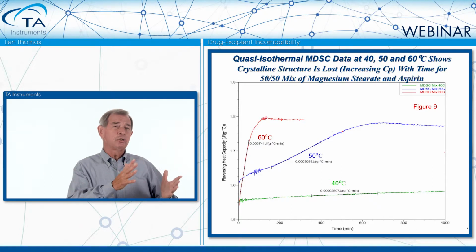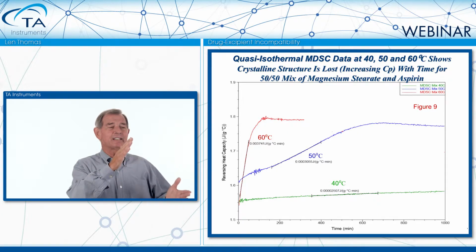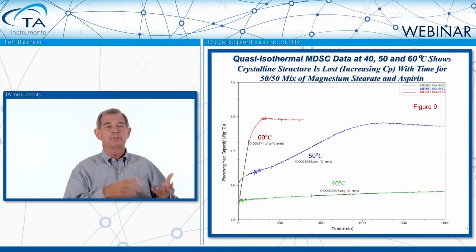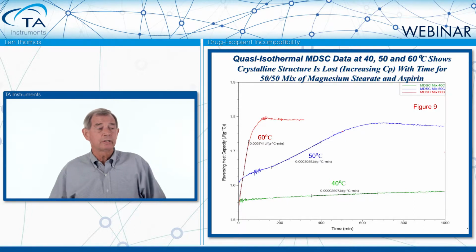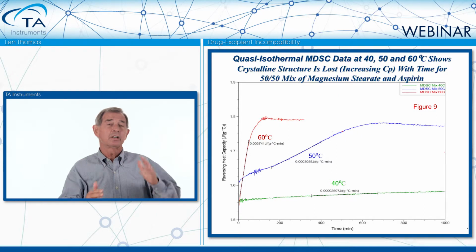That would actually be a good temperature for doing your chemical analysis because you have a window then of about 6-8 hours that you can be pulling samples, putting them in the oven, doing your chemical tests the very next day. At 40 degrees, the reaction is really going very slowly, but you can still see the slope. Now, the software will measure the slope for you. You just pick your limits, and those limits are shown on there. You pick your limits, the software will measure that slope.